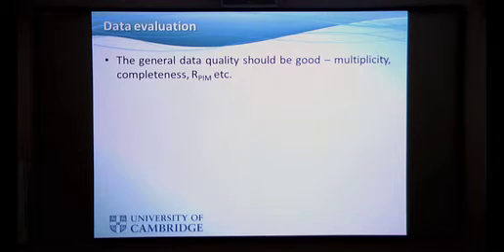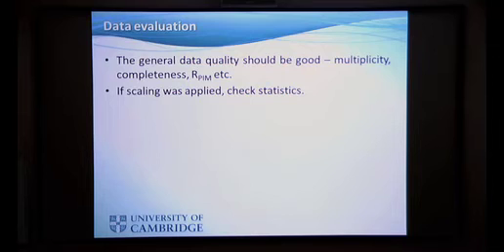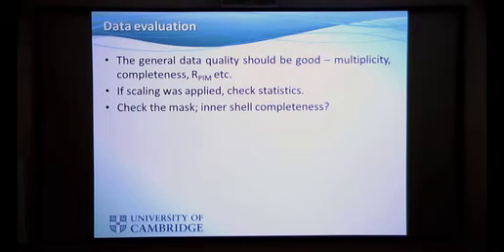Data evaluation: your general data quality should be good. You need a good multiplicity, good completeness, Pim, all the quality indicators should look good, and you should make sure they look good. If scaling was applied, check your statistics. In particular, if you encounter problems, you want to know what happened in scaling, but you will need it.